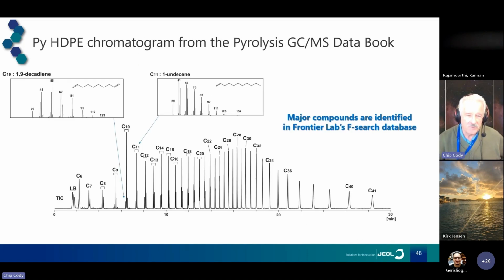It's a one-dimensional GCMS measurement. Essentially, you're basically just getting the alkanes, alkenes, and alkadienes as the major peaks here. That triplet goes out in time. Now, this is a fast GC run, so things start to merge at later times. There are a few little peaks in the baseline.